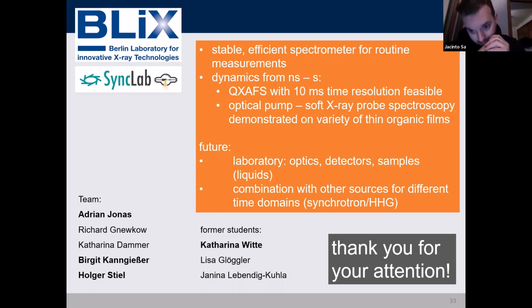Yeah. In our setup right now, it's not possible, but we have been thinking about it. The laser beam path is just with mirrors, but we have been thinking of doing that with optical fibers also, which would make such an experiment quite possible. We've never thought about it before, but let's keep thinking about that. Yeah. Good. Okay, Adam, you have a question?